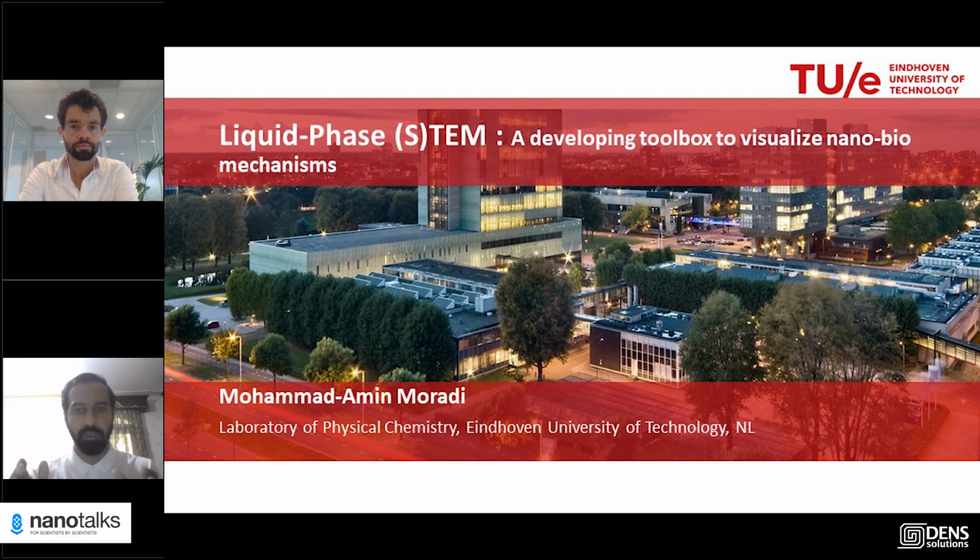I know that even with the silicon nitride cells, people have recently imaged some polymer particles, some latex particles, some vesicles, but they were not able to really go for the high resolution. With graphene, you can do that. The examples that I showed were sandwiches of graphene over polymer vesicles, low contrast polymer materials, where you could see a very high dark signal from your polymer, which was not the case even in cryo.